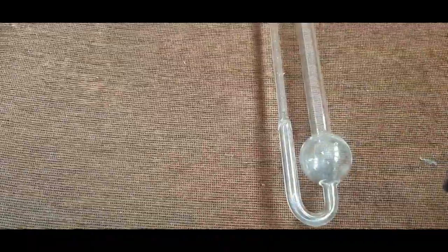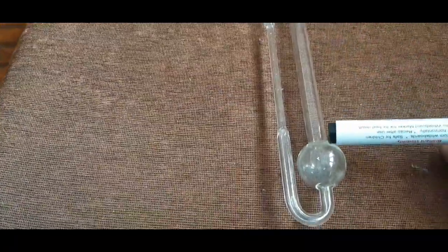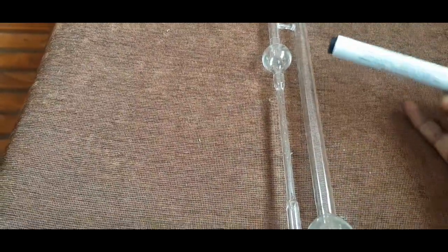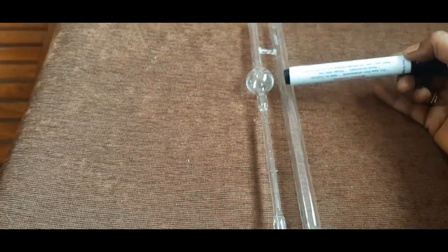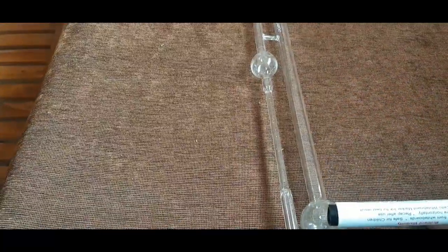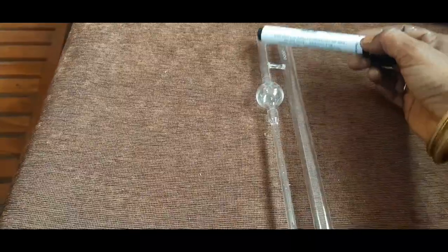This is the Ostwald viscometer, a U-shaped apparatus consisting of an upper bulb and a lower bulb. There is a capillary tube here. One limb has a wider mouth, another limb has a smaller mouth. We have to drain the solutions through the limb that has the wider mouth, and after that you have to pipette out through this.